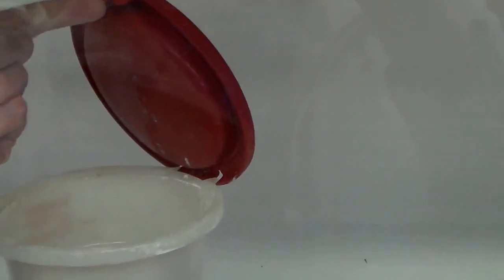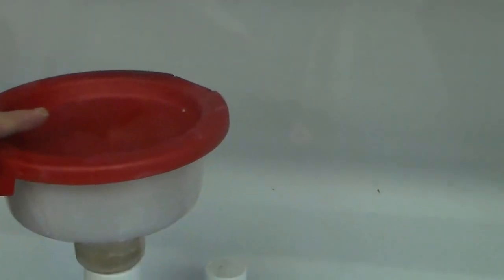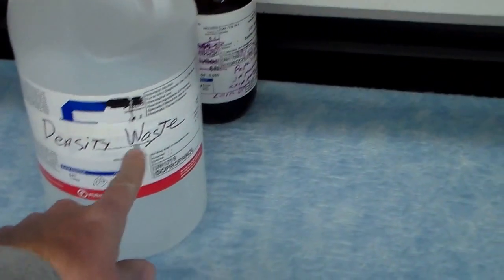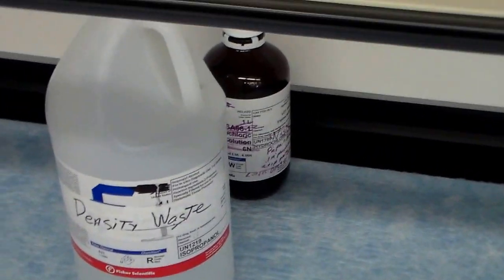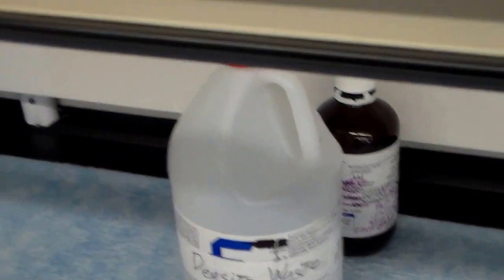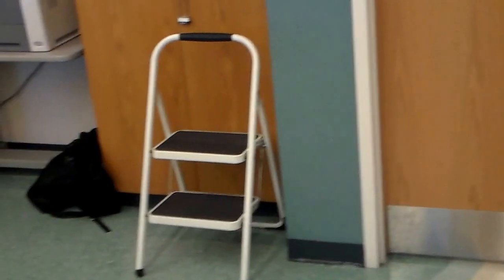You can see that we have a waste bottle here. Keep in mind that this is a toilet seat. Don't pour waste on the toilet seat. Lift the toilet seat before use. When done, close it again. This is where most waste for the lab will go. We'll specify when things can go down the drain instead. That is the quick safety tour of the Chem 1 lab.